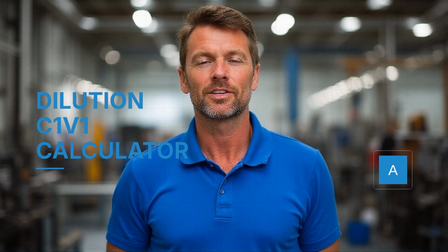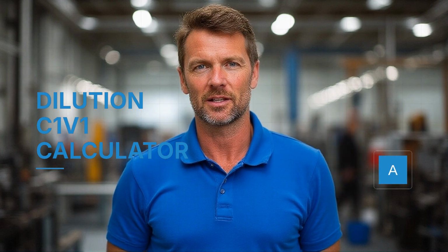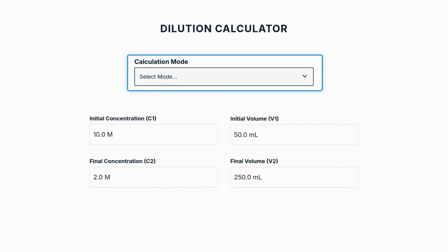The Dilution C1V1 Interactive Calculator solves the fundamental dilution equation to find any missing variable in your dilution calculations. Let's explore the interface. First, select your calculation mode from 6 options.